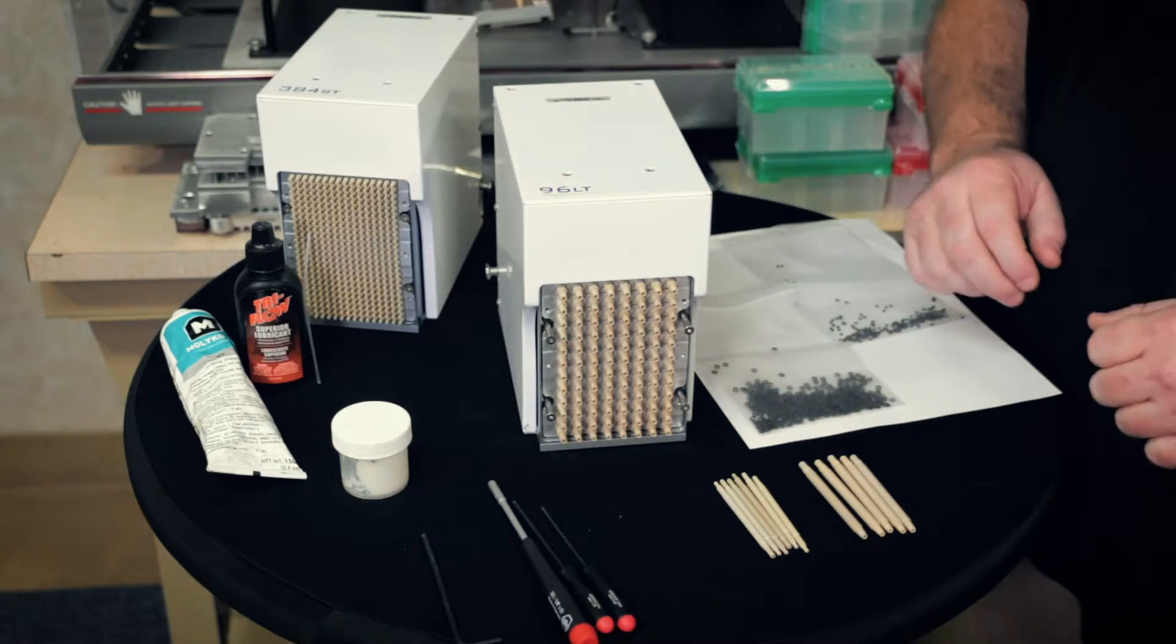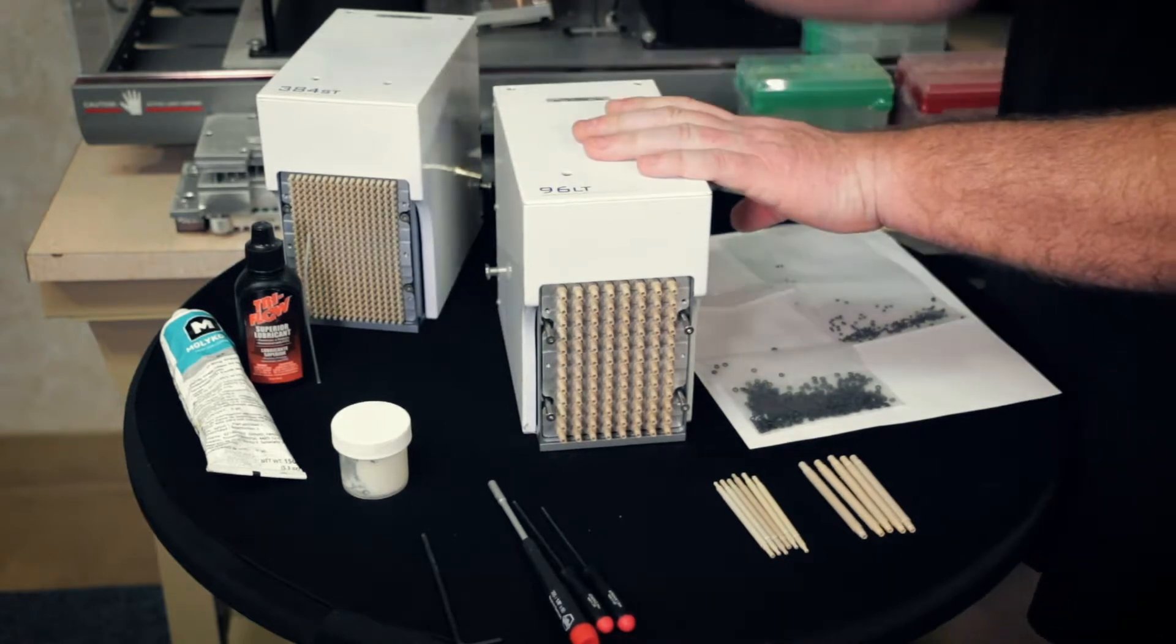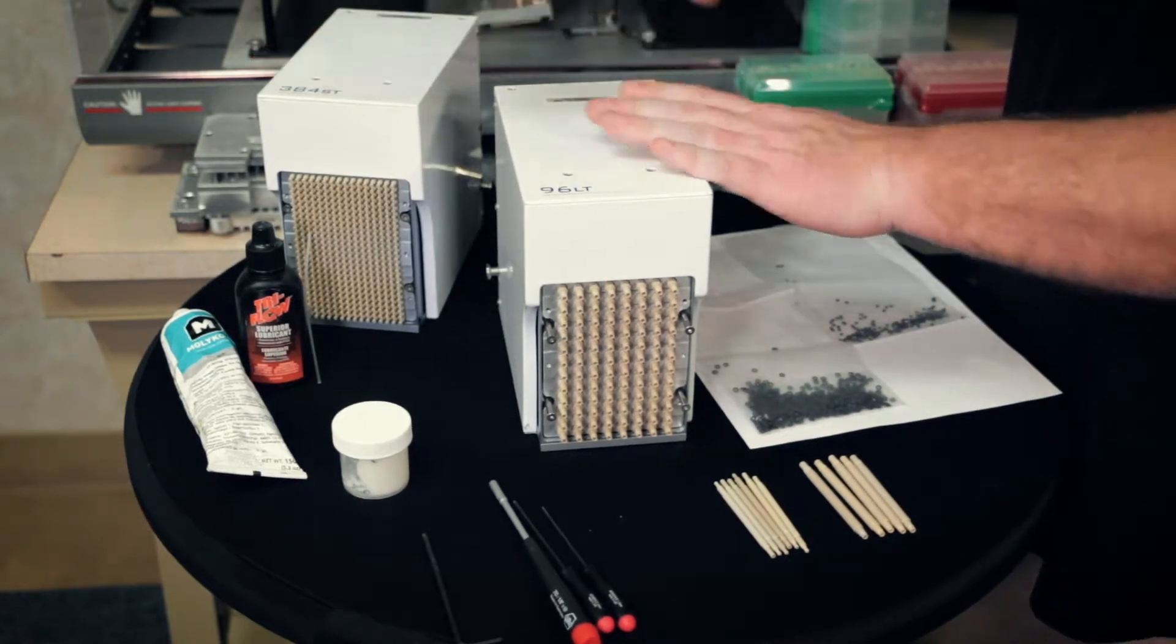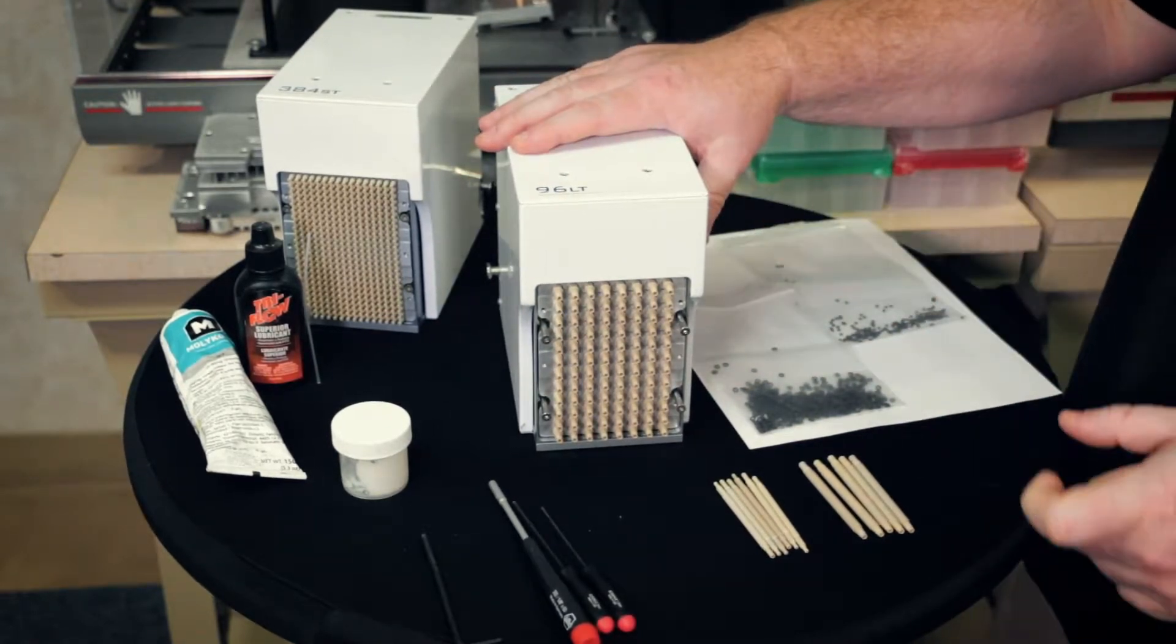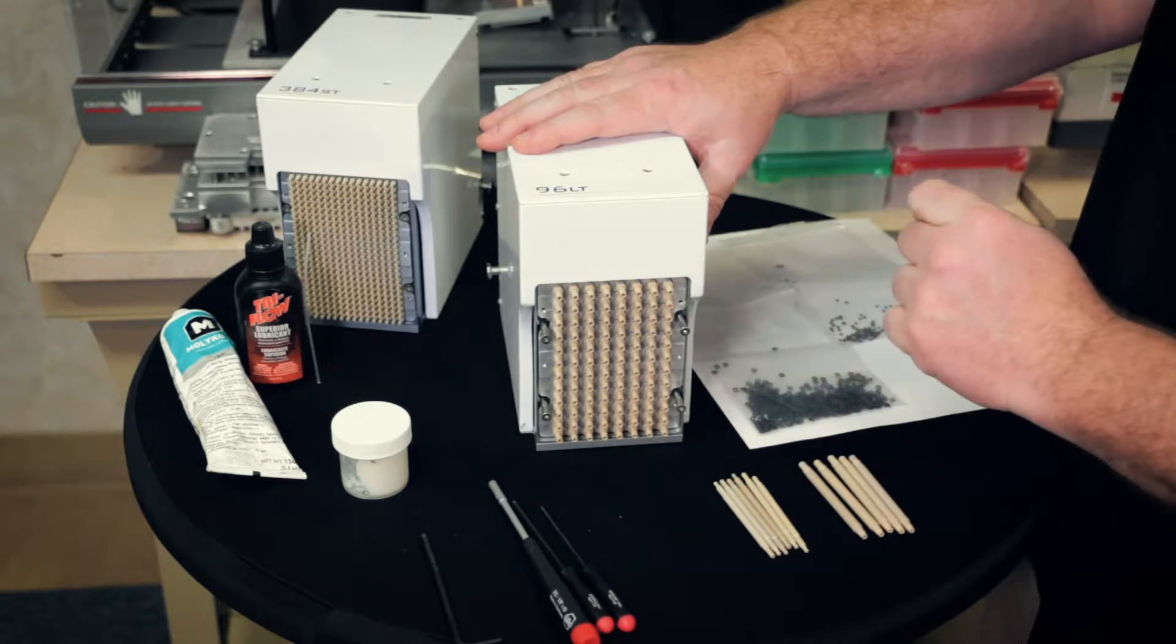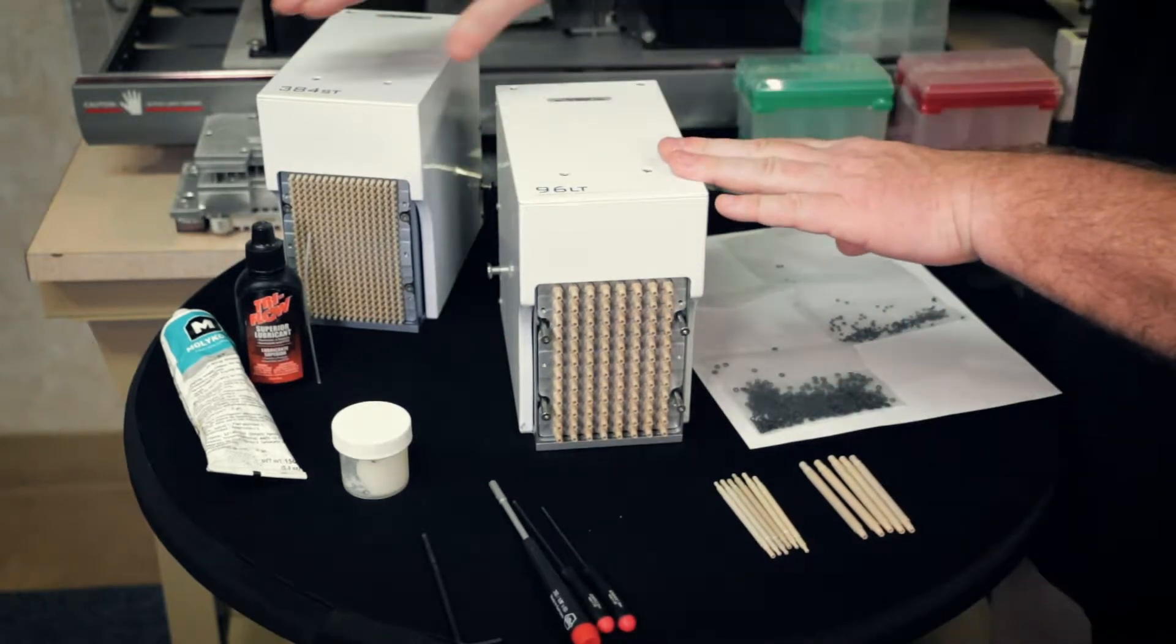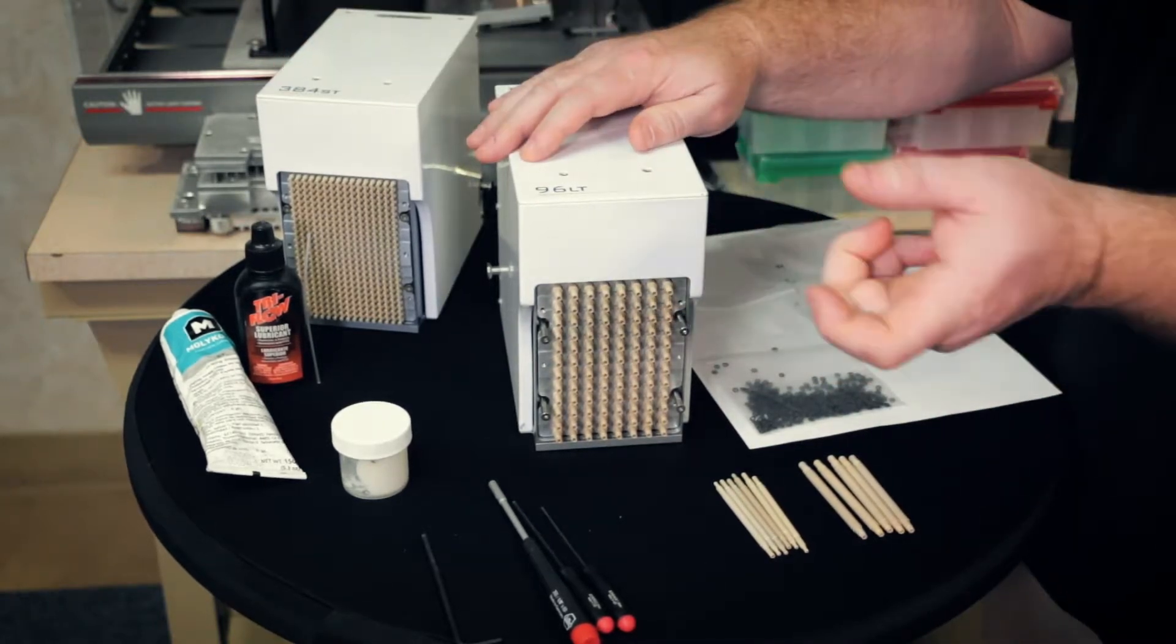So there's two main types of heads. You have the 96 channel head and the 384 head. There's two versions of 96 head you want to be aware of: the LT, which is a large volume tip with a bigger barrel, and then the ST, which are on the 384s, which is a smaller volume tip.